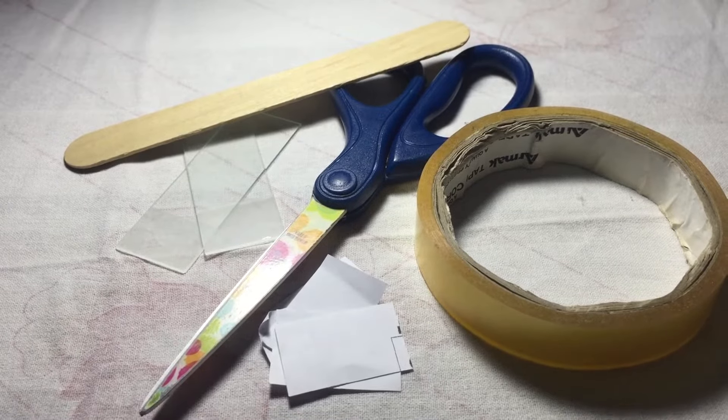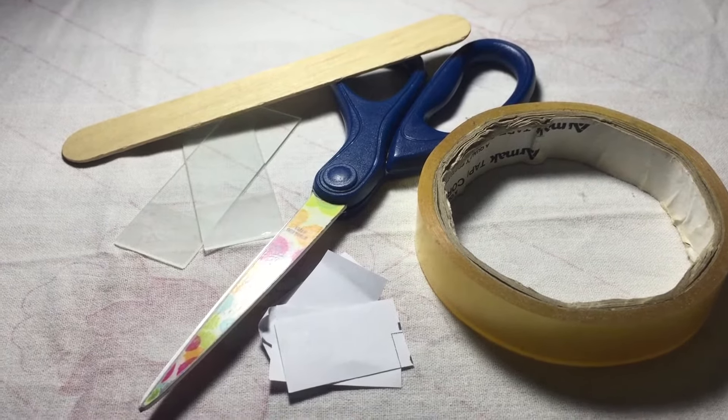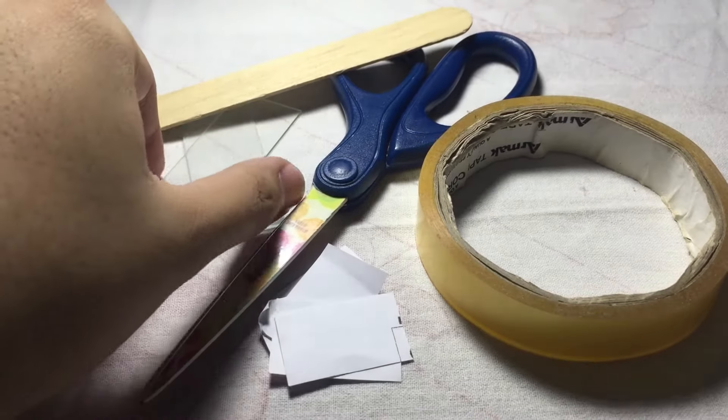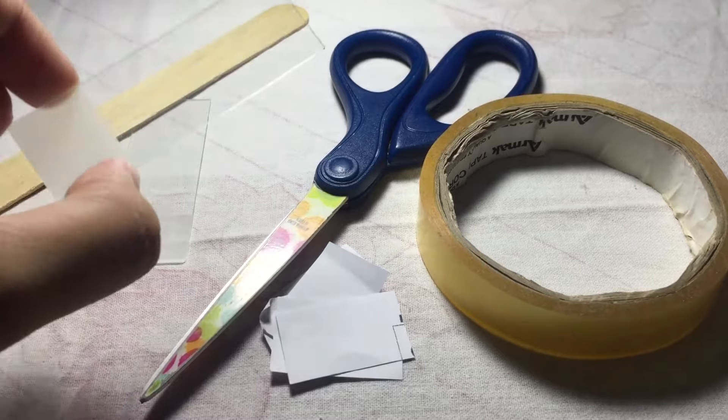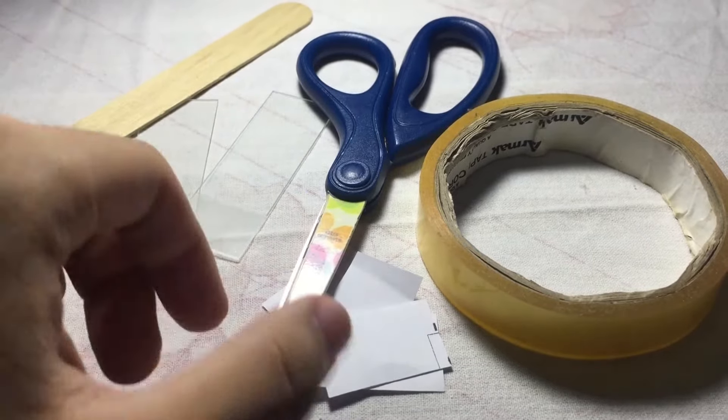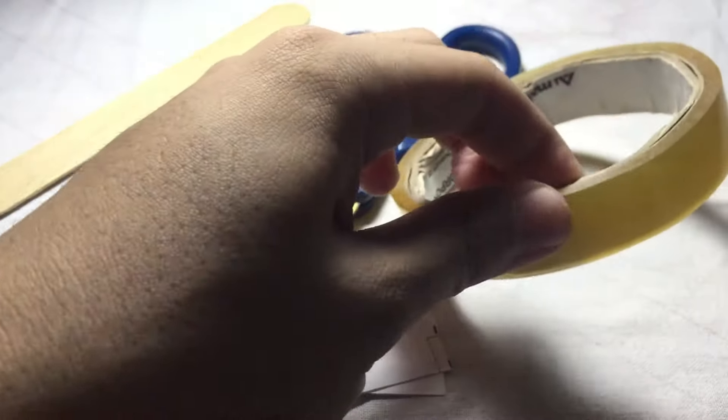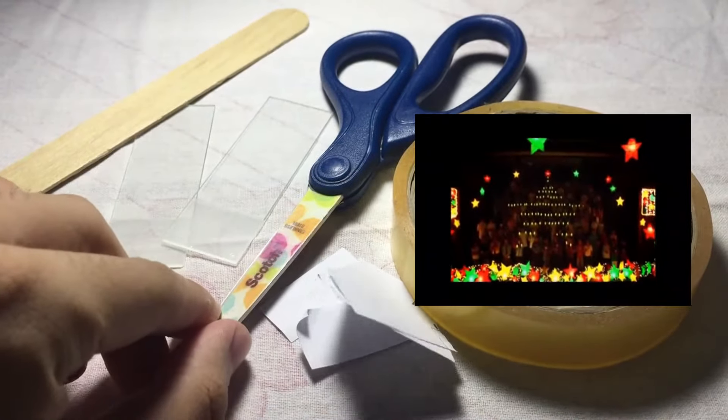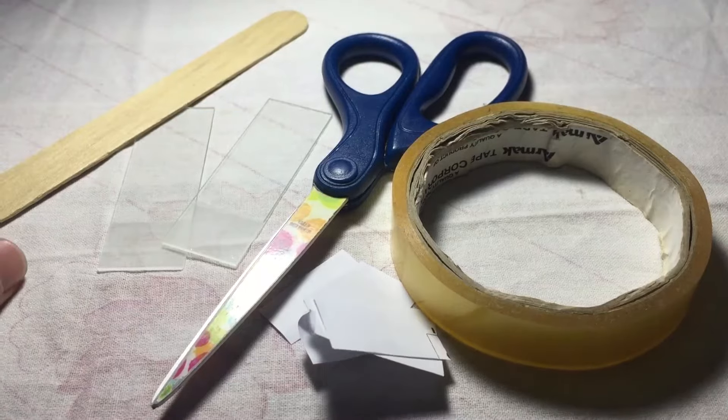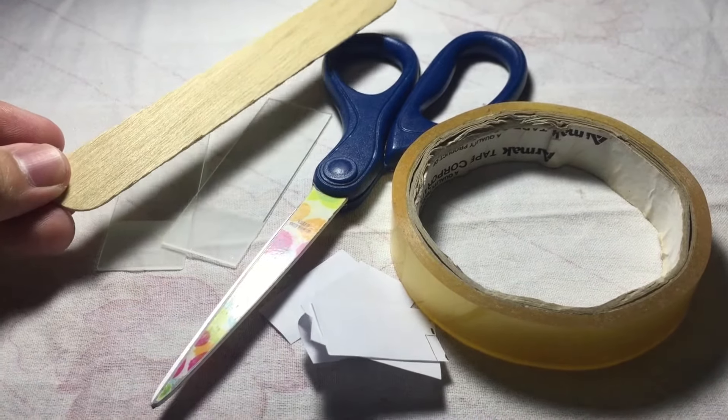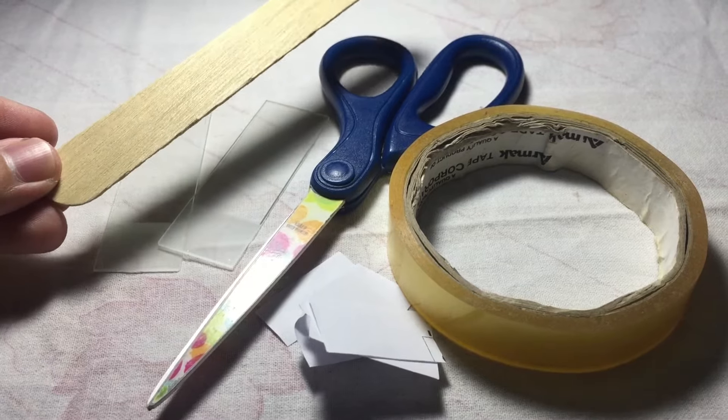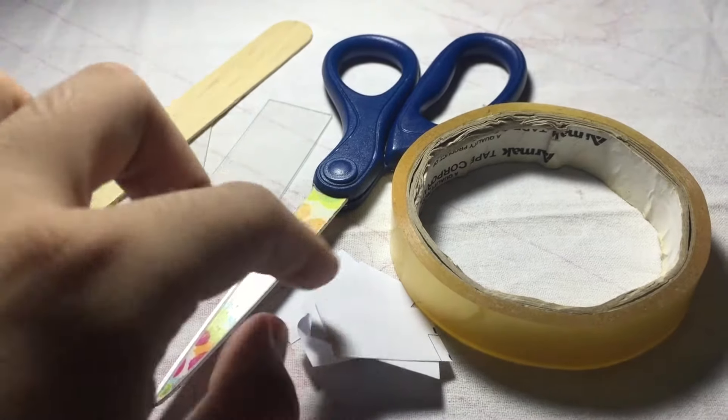First, we need two frosted slides. Next, the main star is your scotch tape. Then you have scissors to cut the scotch tape, and a tongue depressor to demonstrate how to get the sample. Lastly, your pieces of paper which will serve as your label after getting your sample.